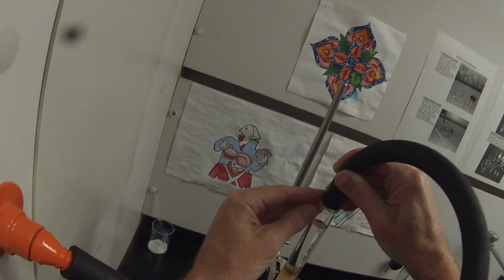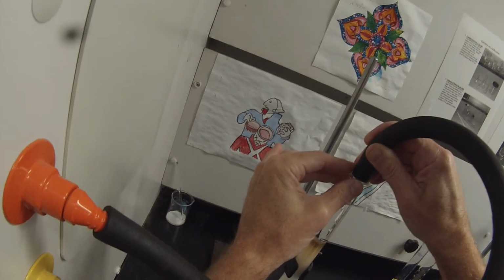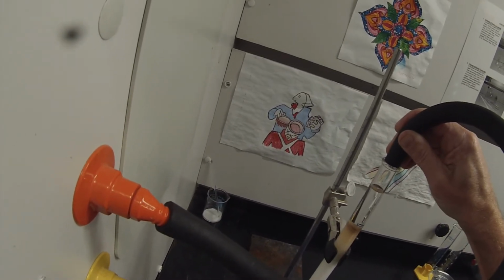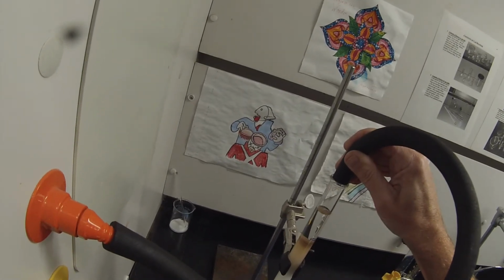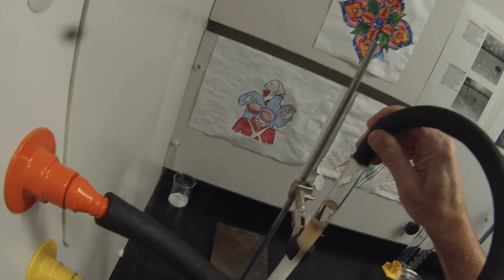You may have seen in some of the papers that talked about flash chromatography. That uses a much finer size silica. So that actually requires air pressure. And so I'm filling that up to about that 5 milliliter mark, 6 milliliters maybe, and then I'm going to scoot it over to the next one. And you can see that the color is going down. You can see that that air bubble is coming out. So I can run this. Right. There's no disadvantage to running it fairly quickly.